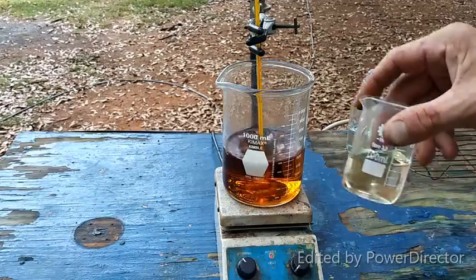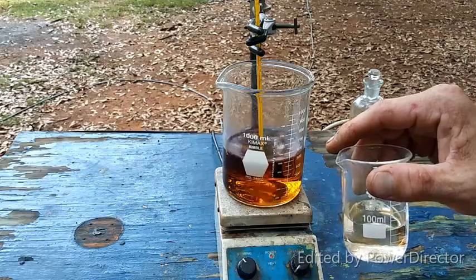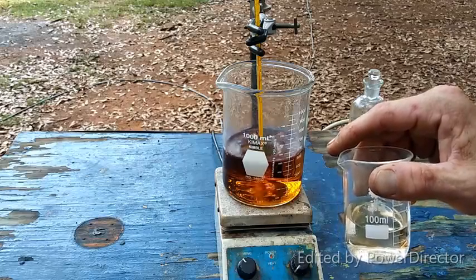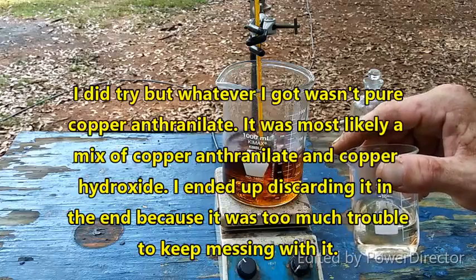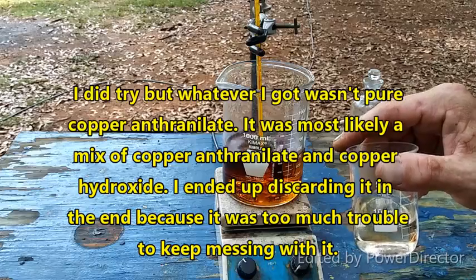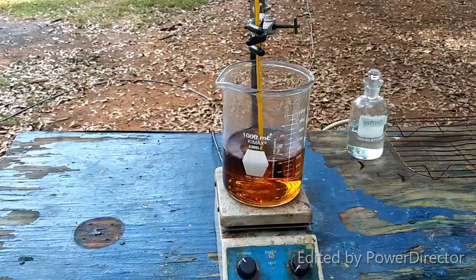If this is theoretically sodium anthranilate, it'd be interesting to see if copper would drop that out too. Then again, it's alkaline. That may not work. I don't know. Could be interesting to play with. So, anyway, I don't care about a perfect yield. I really don't.